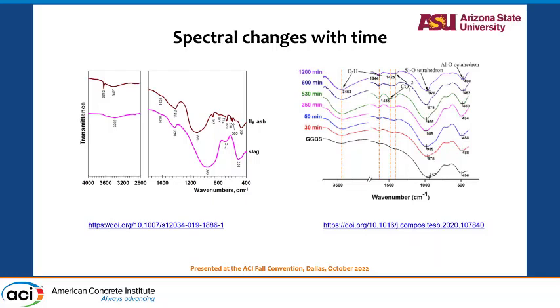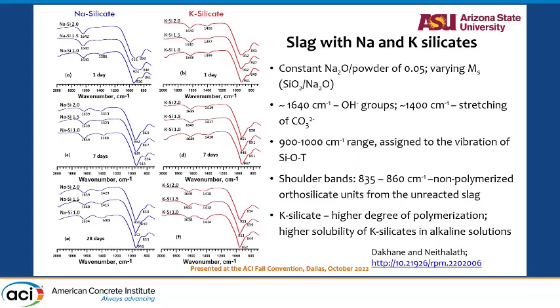So these are all characteristic signatures from which you can find out what the material is. But again, you look at it and you say, okay, how do I know where the peak is? There's such a broad peak. Your instrument generally gives you where it thinks the peak is, but it has lots of problems when you deal with very heterogeneous materials like the ones we are dealing with. But generally the idea is that yes, we can use it as a qualitative method, understand where those peaks are, understand what those preliminary predominant bonds are, and say, okay, do I have aluminum replacing silica in the tetrahedron?